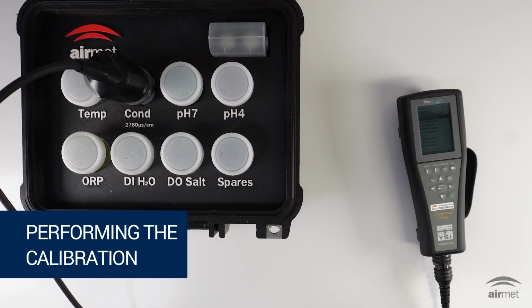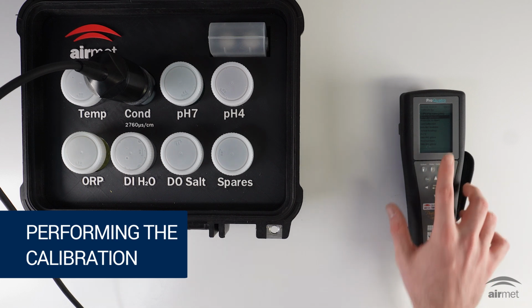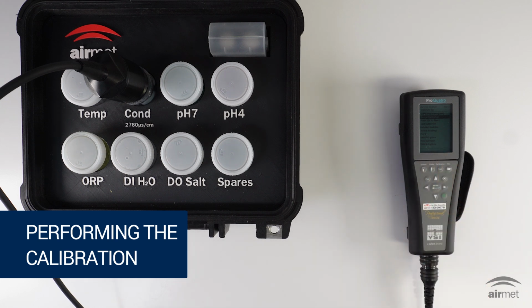Wait for temperature stabilization. The instrument will monitor the temperature and conductivity values. The calibration should not proceed until the reading is stabilized. This should take around 20 to 30 seconds.